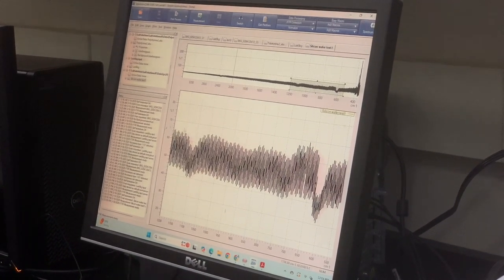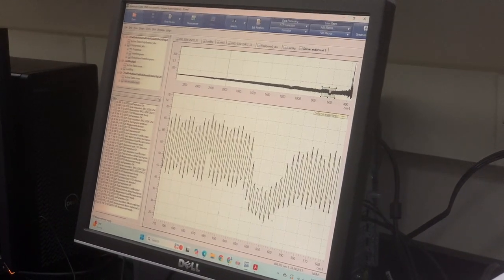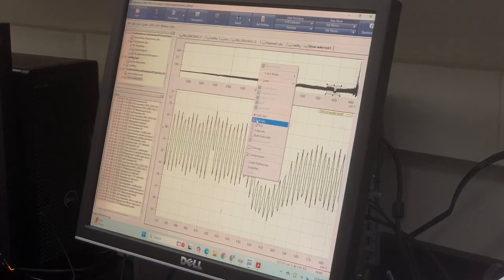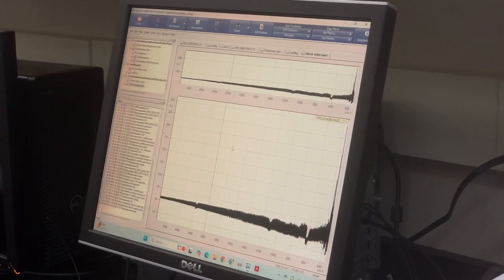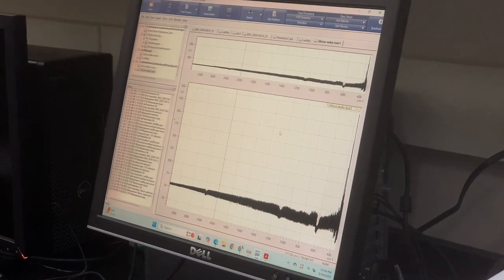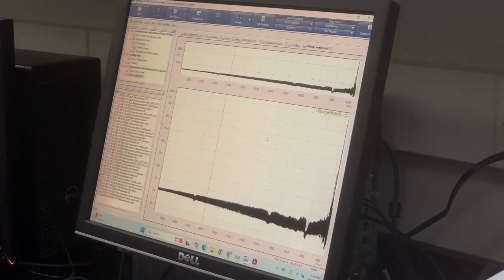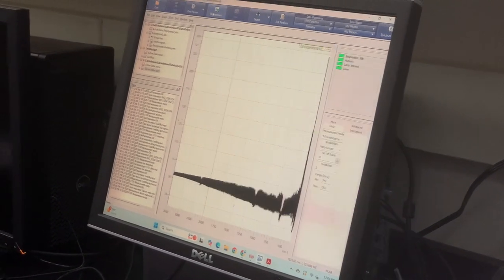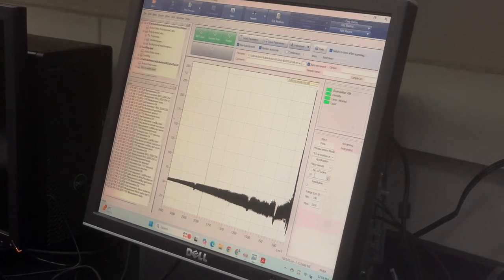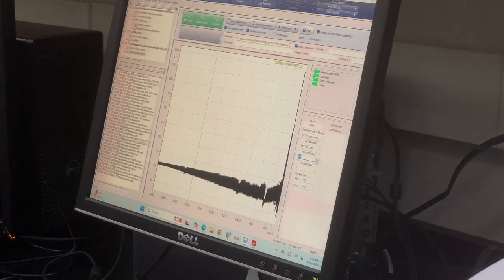It looks very nice, it bumps up and down. Yeah, I'm not surprised it looks like that. It's outrageously opaque. So you think maybe we could increase the number of scans? I don't know if it would help. So increasing the number of scans, we would have to scan it very, very slowly. We're doing 10 right now, so it's pretty low. Oh, that's very, very low. The average is like 45.